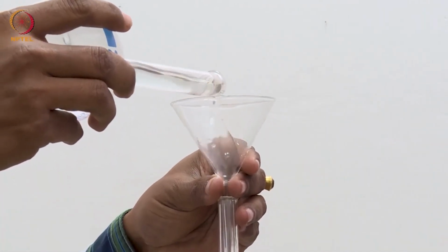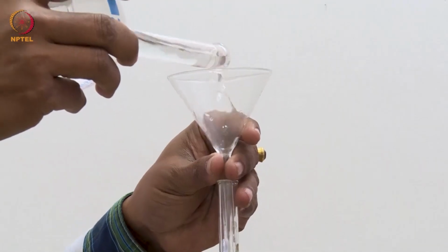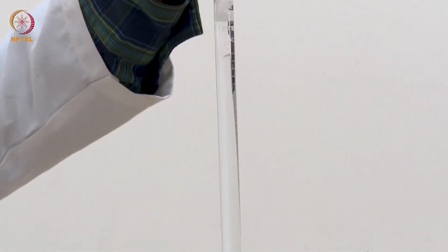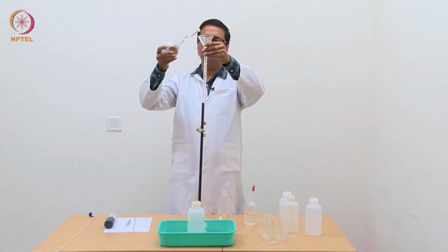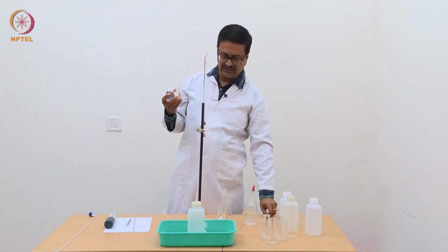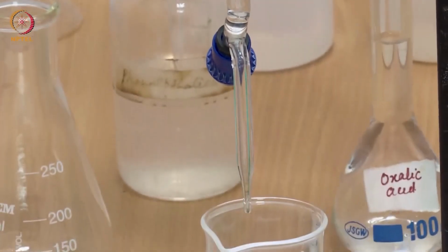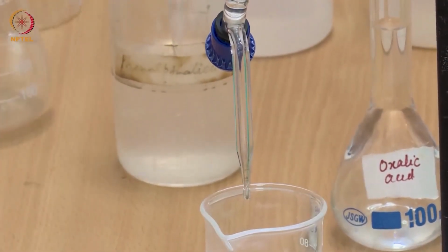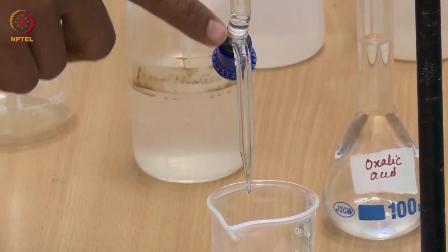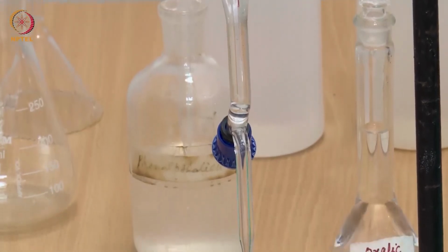The bottom is closed, so we should fill it beyond the 0 mark, because there will be an air gap at the bottom which has to be cleared after we completely fill it. Now you can see that NaOH is filled from this joint where we have the stopcock to the upper portion and the lower part is empty.